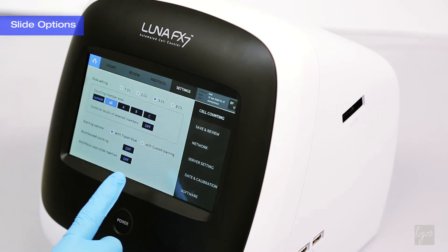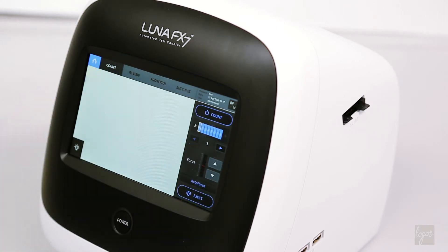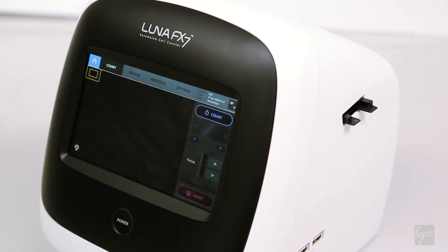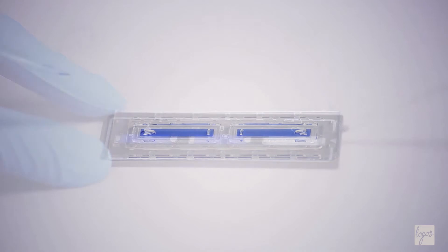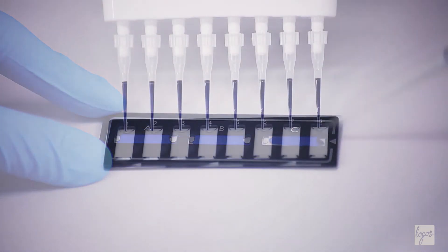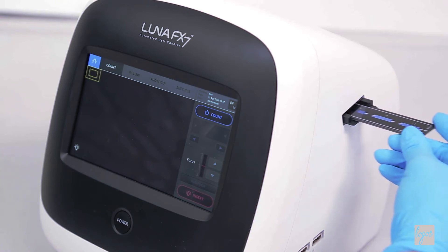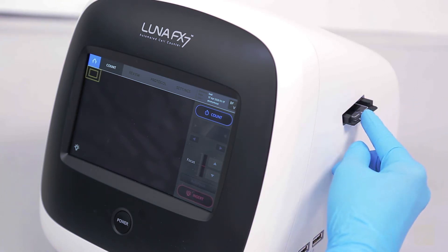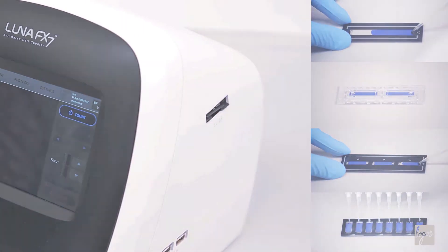The LUNA FX7 can utilize a range of slide formats in addition to the standard two-chamber slide. For optimal accuracy, there is a single-chamber slide with a nearly 5 microliter counting volume. For more convenient data management, you can utilize a three-chamber slide. To maximize throughput, we offer a multi-channel pipette-compatible eight-chamber slide.